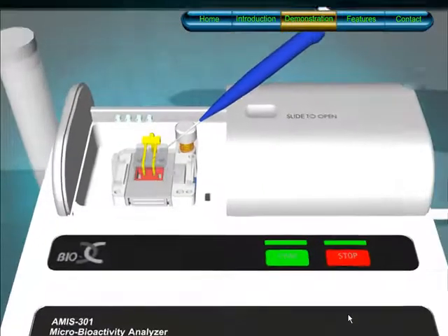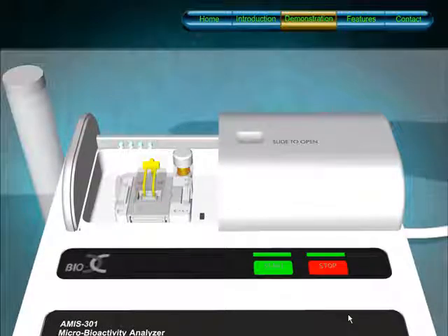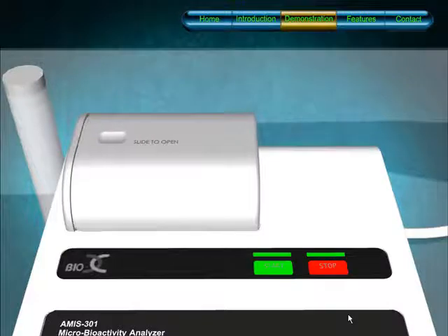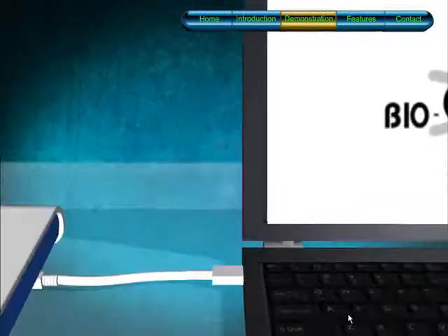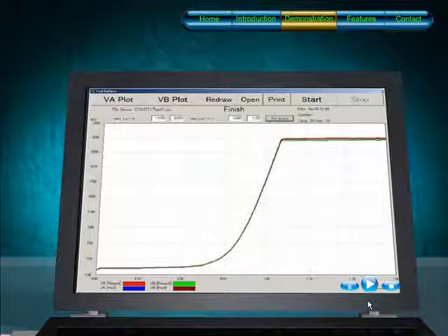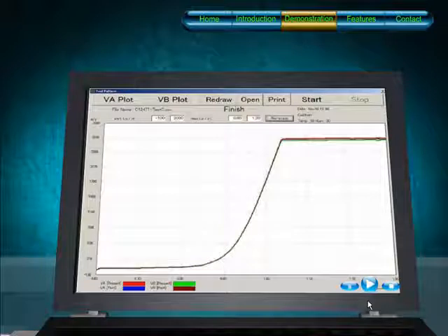The micro size cells with their 20 microliter volume offer great benefits for research work with limited sample supply. We are now ready to perform the test pattern. Click on the play button. These test patterns are displayed for checking the appropriateness of the sensor, sample, reference electrode, and parameter settings. The indicated S-curve confirms the setting correctness to do a measurement.